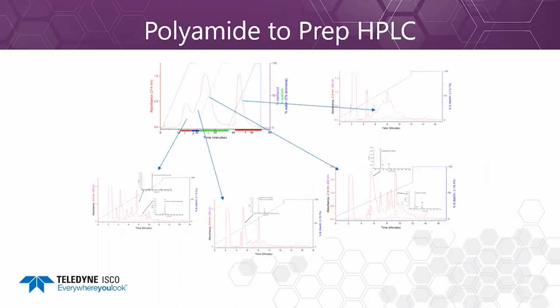There's very different selectivity compared to C18 because each C18 run has peaks spanning a wide range of solvent strengths. For example, the major peak in the methanol acetone gradient had polar, that is early eluting compounds in the run.